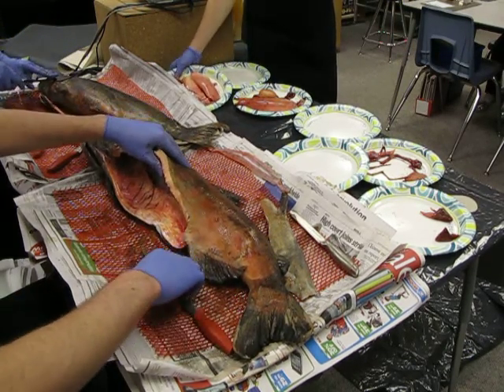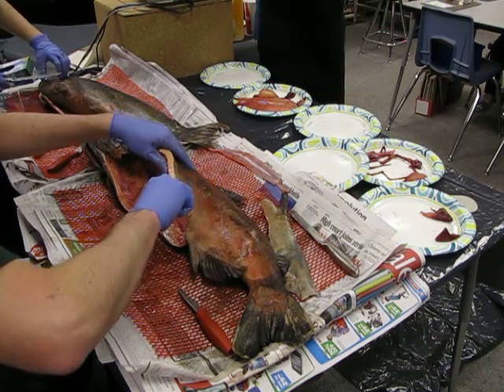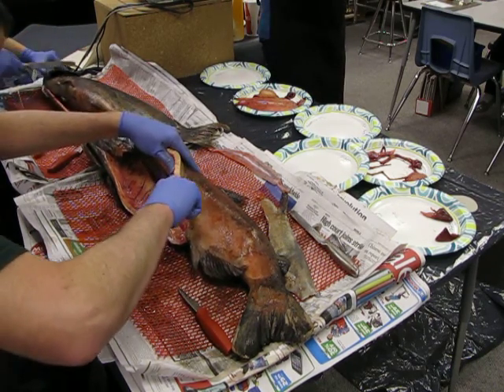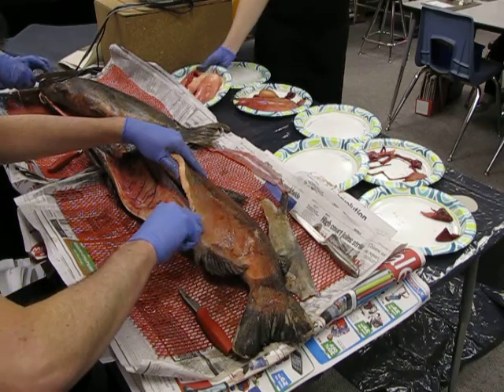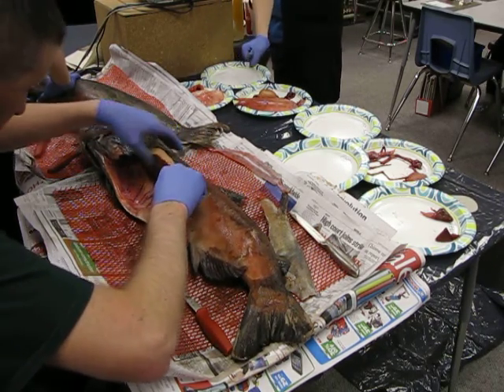So the male, we talked about the eggs in the female. The male has these testes. So this is what would fertilize the eggs in a female to make them alive. Okay? All right. I want to talk about eating and salmon, how they eat.